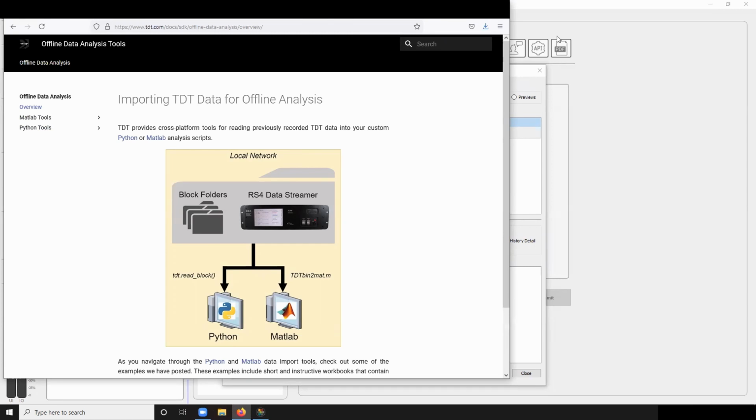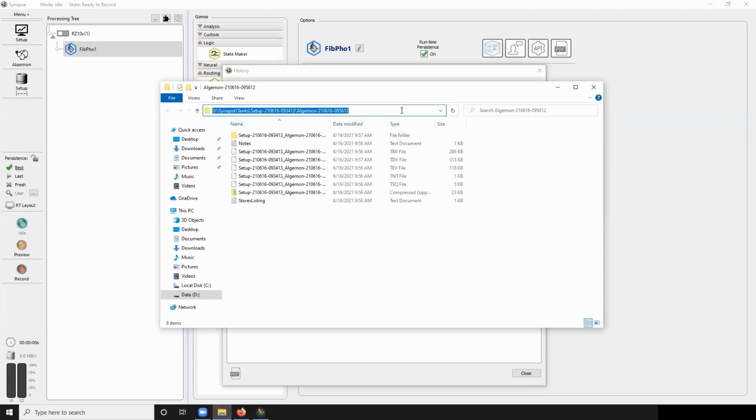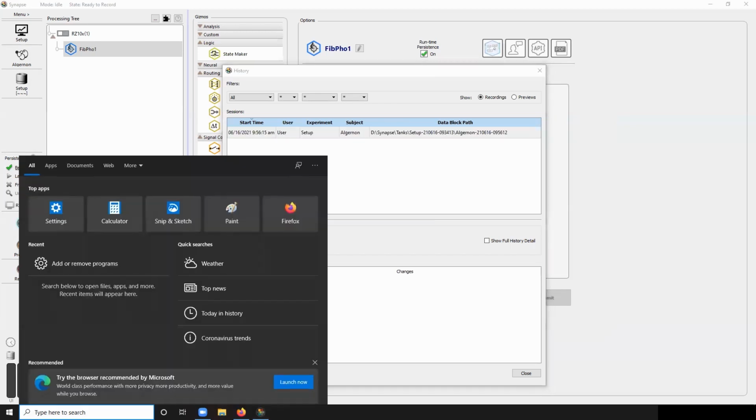And we have these functions to input the data and read them. For both of those functions, the arguments end up being the path that you use. So if I go here, it's this full file path over here, or you can copy the path to clipboard here and use that, because if I go to Notepad, I'll just paste it into here.